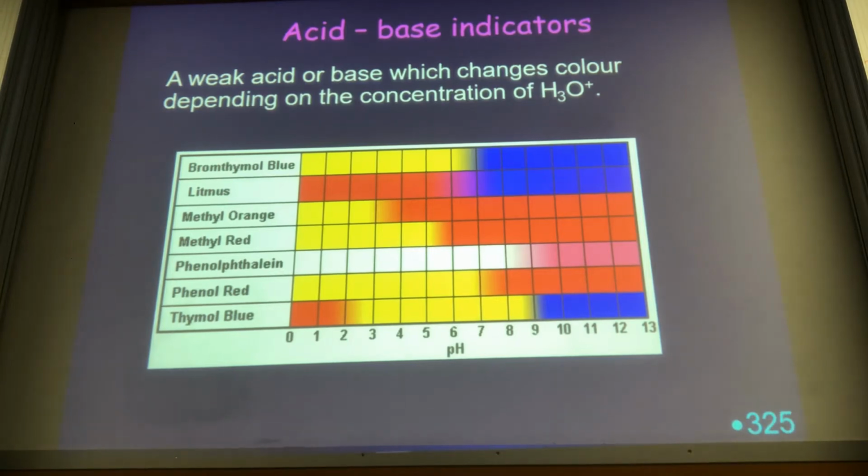Okay, acid-base indicators. So if we're to get a good endpoint, an endpoint nice and close to the equivalence point, we've got to pick the appropriate indicator. The indicator that's going to change colour, give us a first permanent colour change at exactly the right time. So we can see from this visualisation how the colour changes gradually.